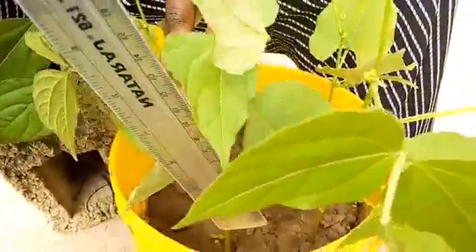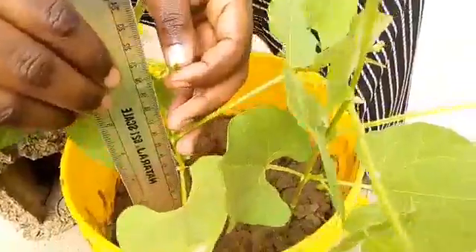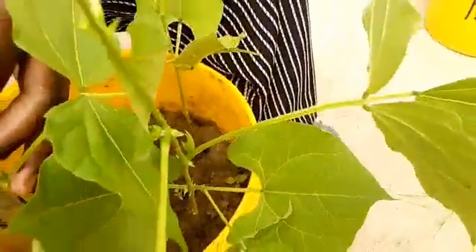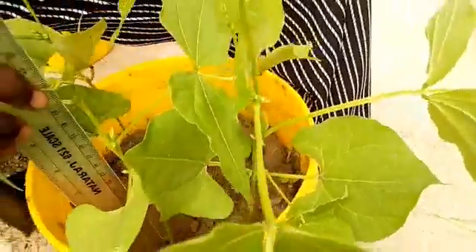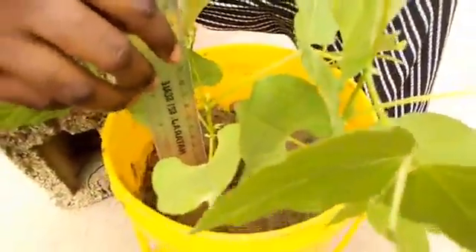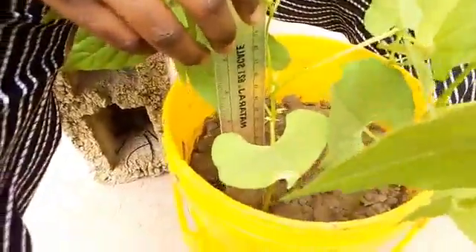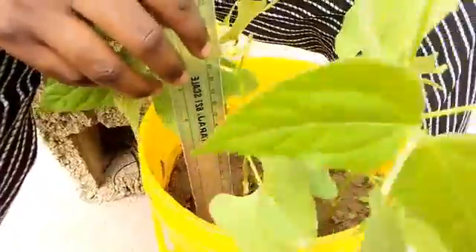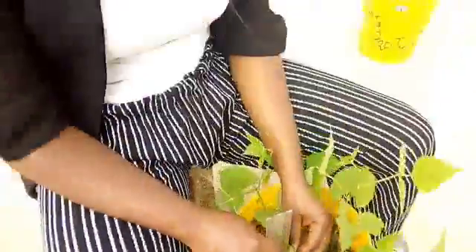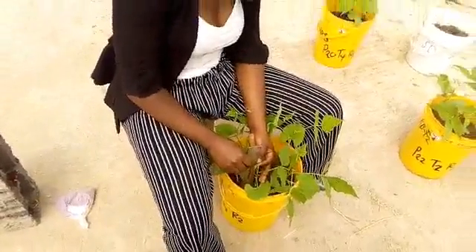Yeah, so this is happening for all the plants. Sometimes you might find that the actual plant height is higher than the measurement because of the same principle behind the taking of the shoot height. Okay, right. So that's 19.9.